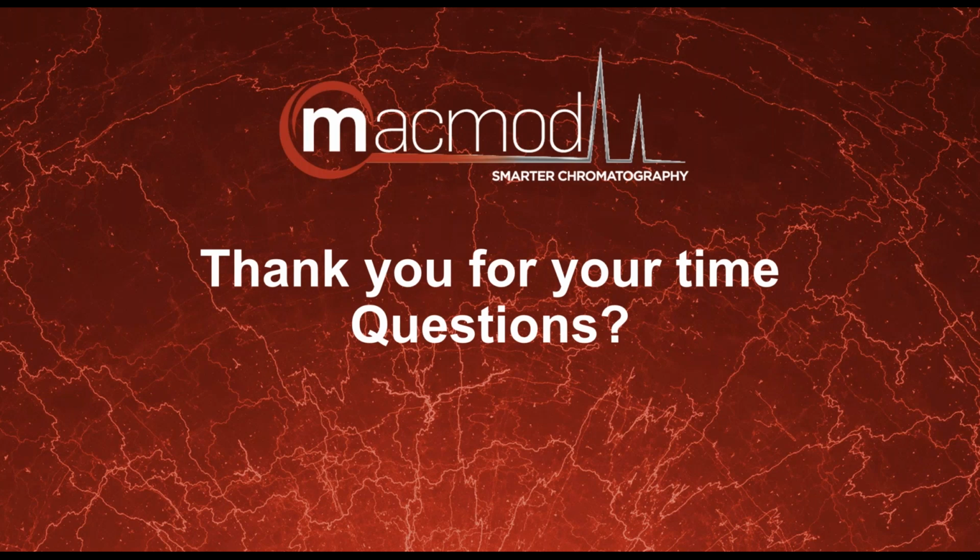Now, for that matter, the C18AR upper limit pH is around 8. So the ion pairs can be 8.5, 9. And so we will look at it, but for optimum lifetime, I believe the C12 would be for more, let's say, rugged use. But if it's just for research, the AR might do really well there. I have seen in the past that ion pair does dampen pi-pi interactions as well. So from experience, I would lean towards a C12, but it's something we are going to look at.